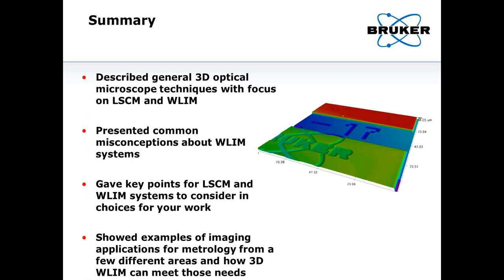So to start with, I gave a brief introduction and overview, and then described some general 3D optical microscope techniques, with then focus on laser scanning confocal microscopes and white light interference microscopes used to do 3D optical measurements. I presented a few common misconceptions that at least I've heard and many others have explained to me they've heard about white light interference microscope systems.